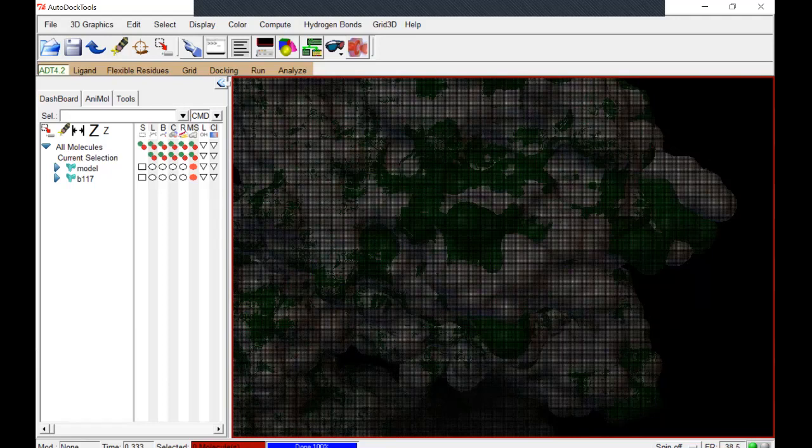One of the key variants that was not in there was some of the deletions that are part of the UK variant, such as the 6970 deletion. But there was another deletion also, and that deletion was Y144. And some of these areas are in the 144 region.